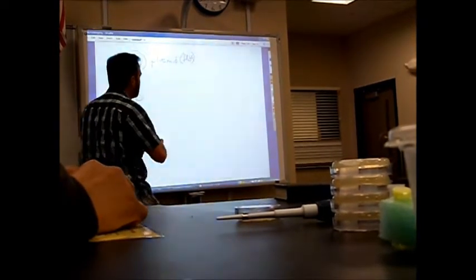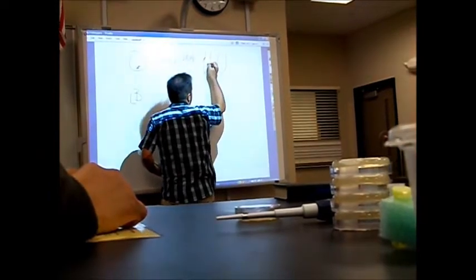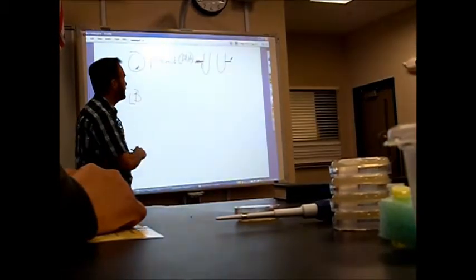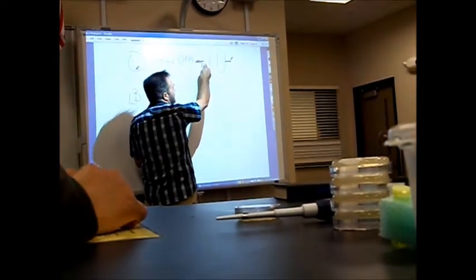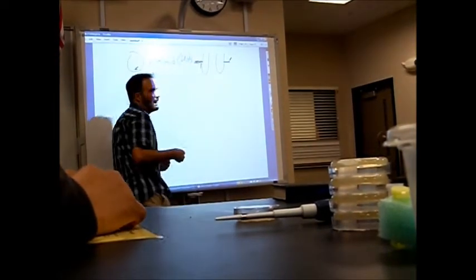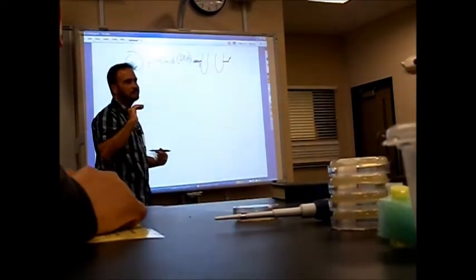Yeah. So you're going to have two tubes of bacteria that you're going to make, right? One tube you're going to label plus, the other one is minus. So there's going to be bacteria here and bacteria here. The difference is that these bacteria are going to get the DNA, and these bacteria are going to get nothing.